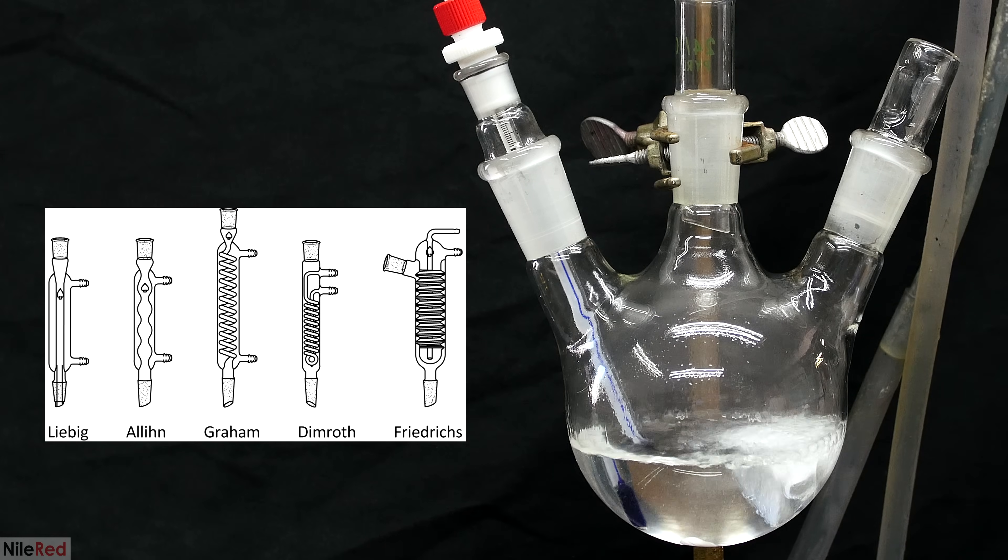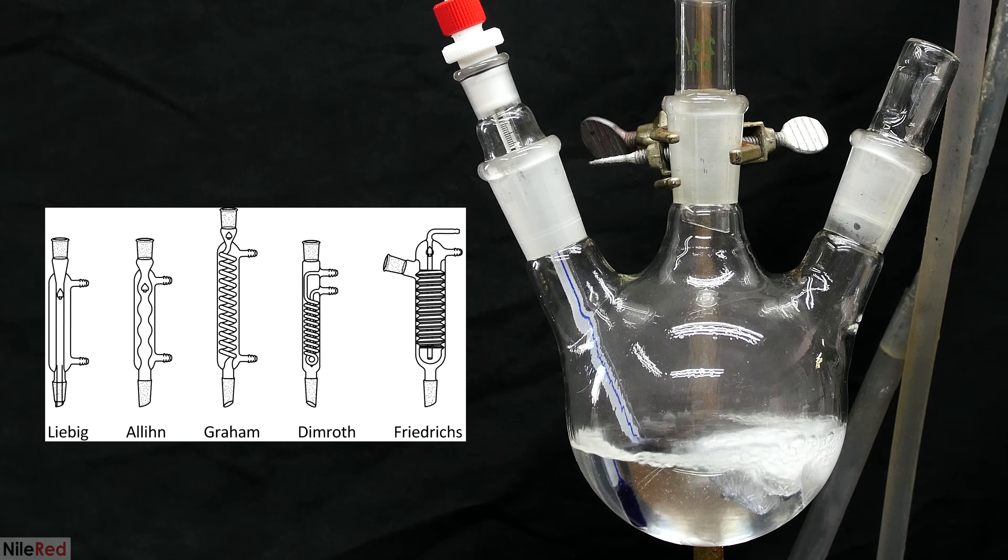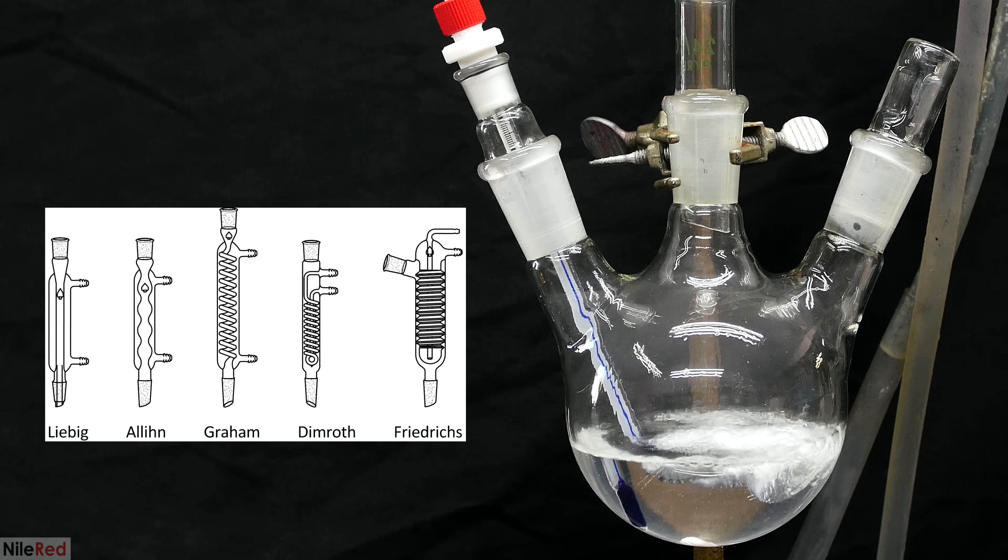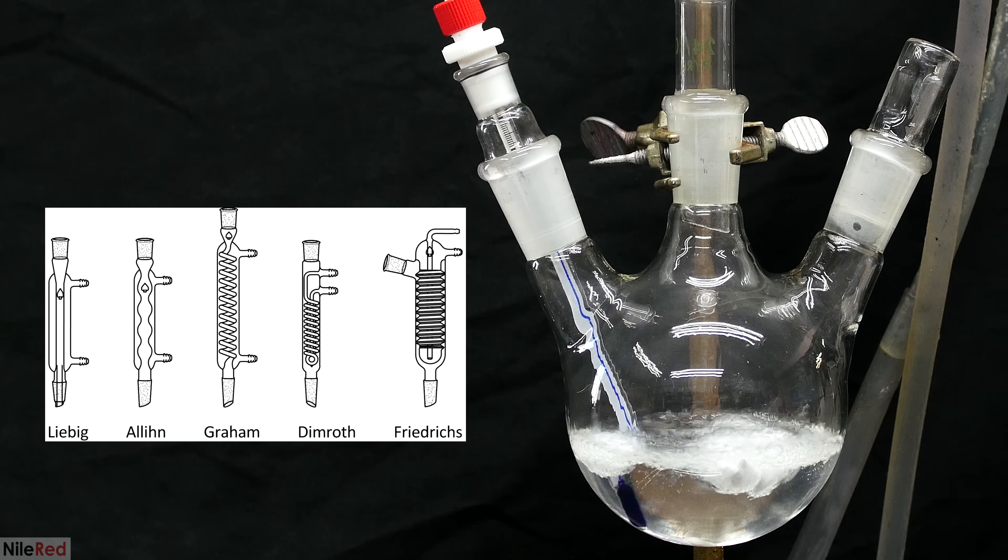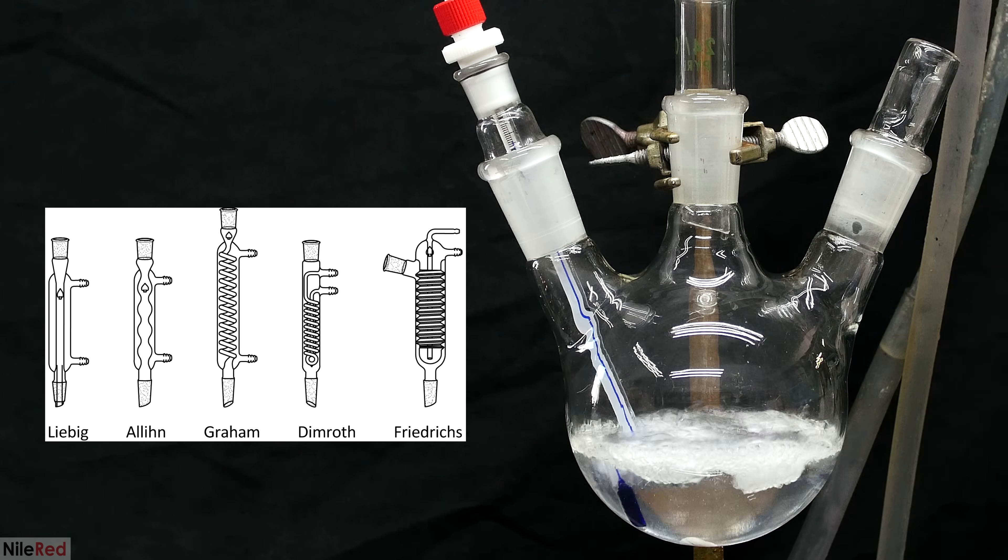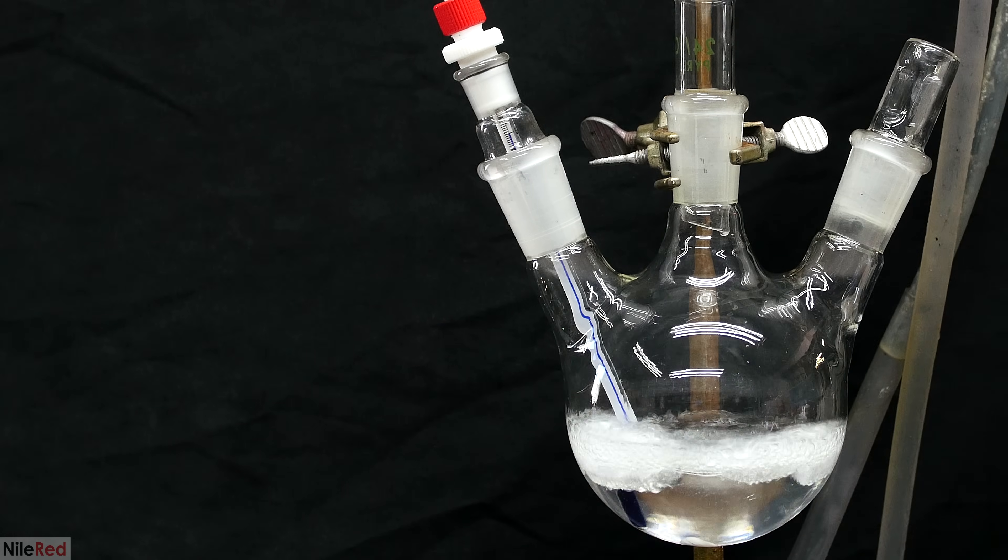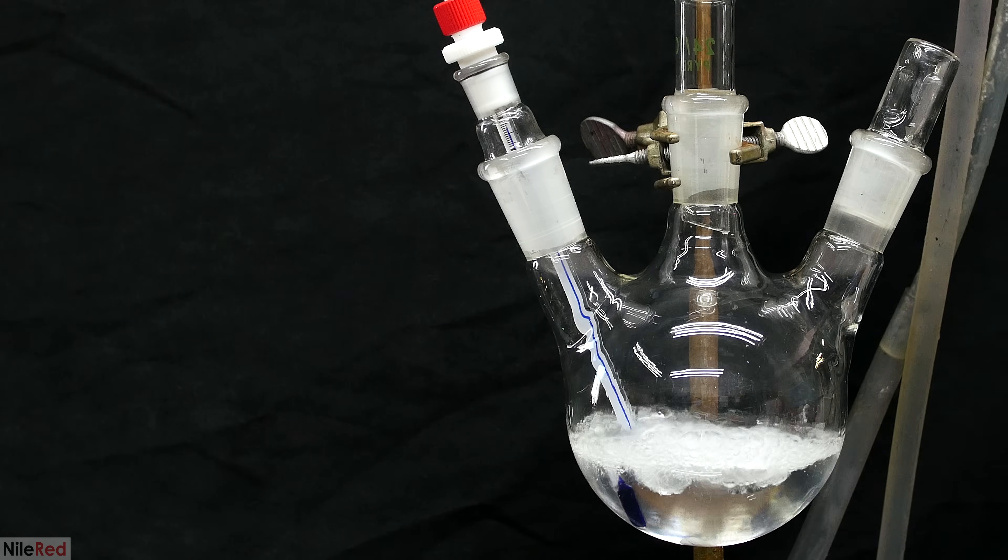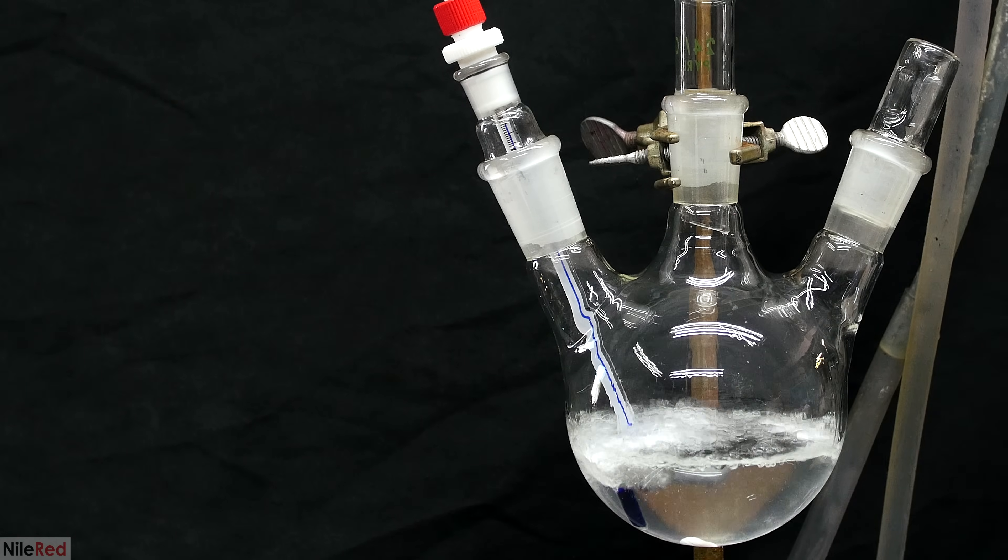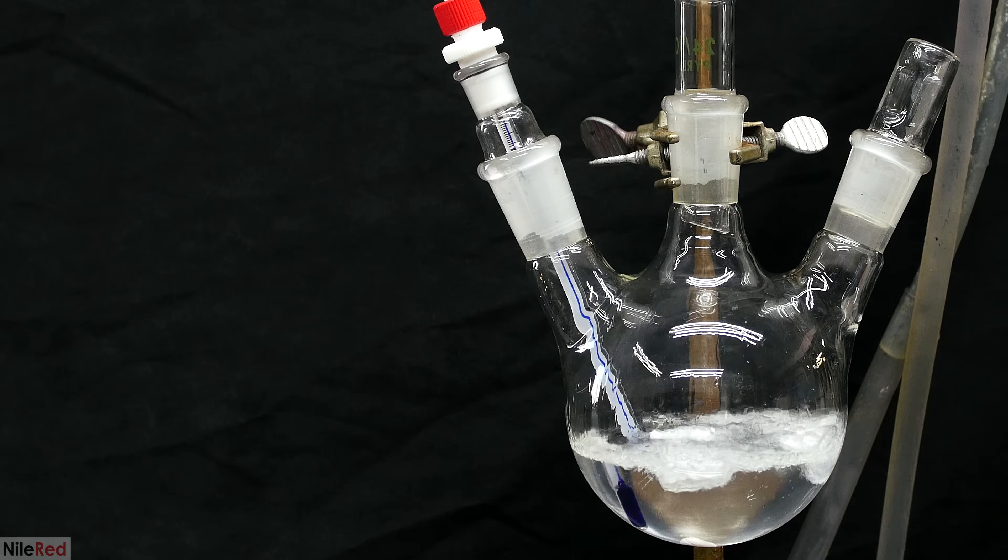This means that you should absolutely not use a Liebig or a Graham, and you really need to use something like a Dimroth or a Friedrich-style condenser. On top of this, the water in the condenser should be ice cold, and you shouldn't use tap water or room temperature water. I didn't film it, but just for you guys, I tried to see if I could get away using a Liebig with ice cold water. The answer that I got was kind of, because I mean it works, as long as you don't mind methanol splashing everywhere and flying out the top of your condenser.